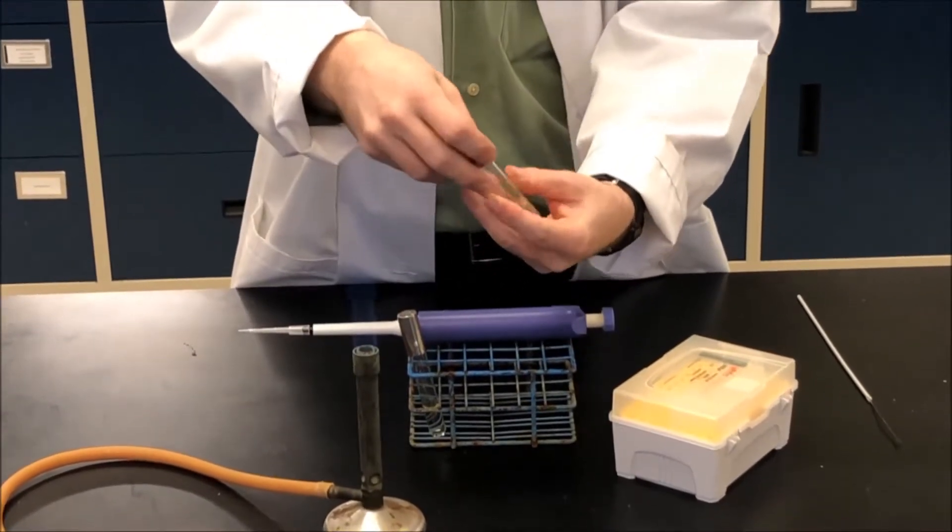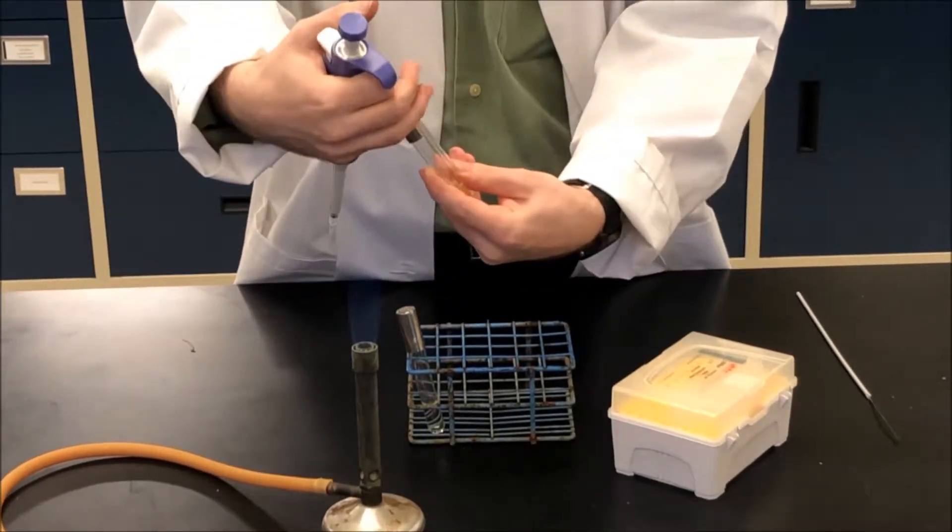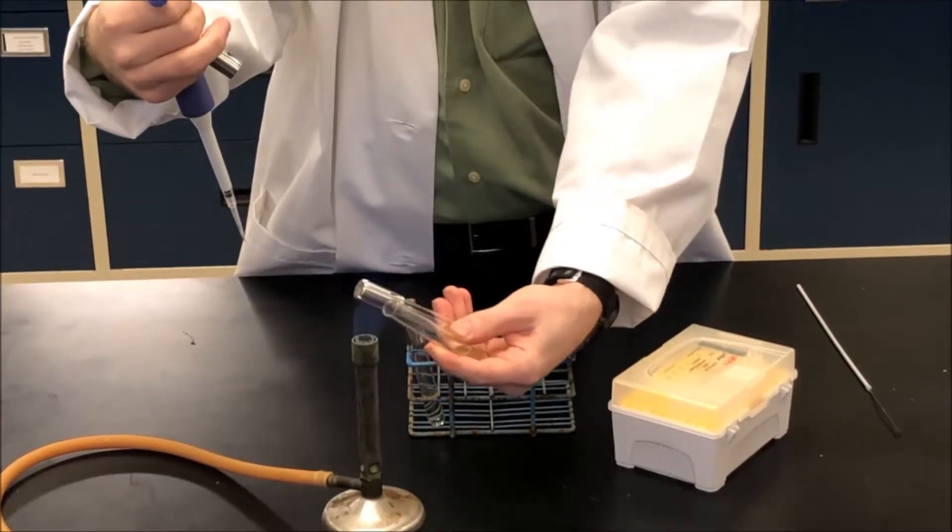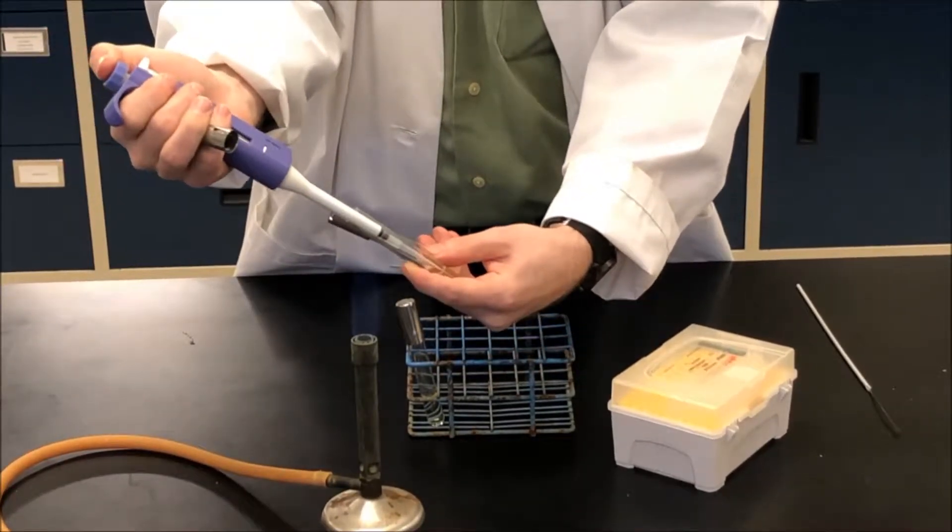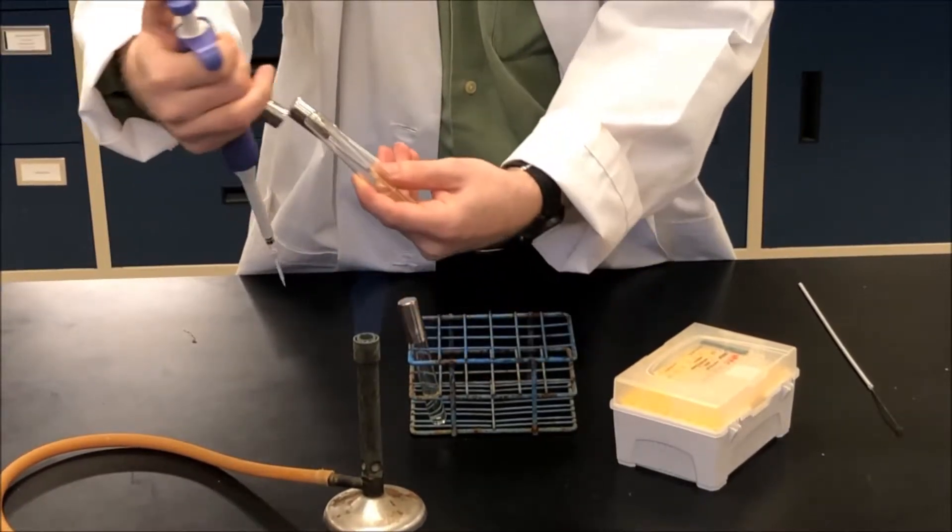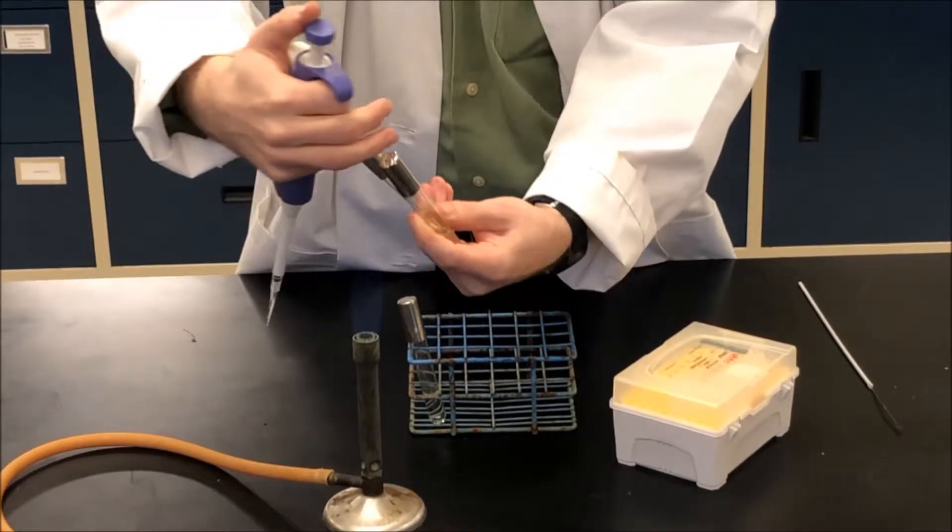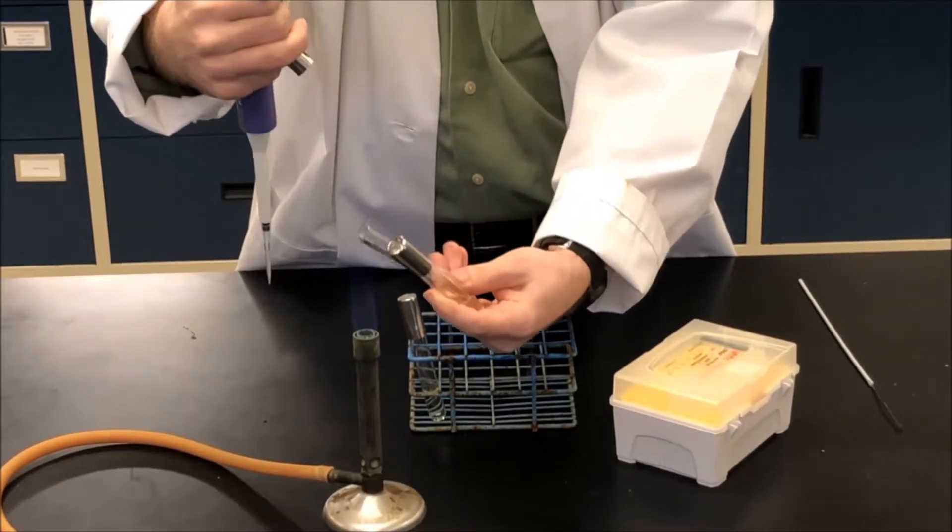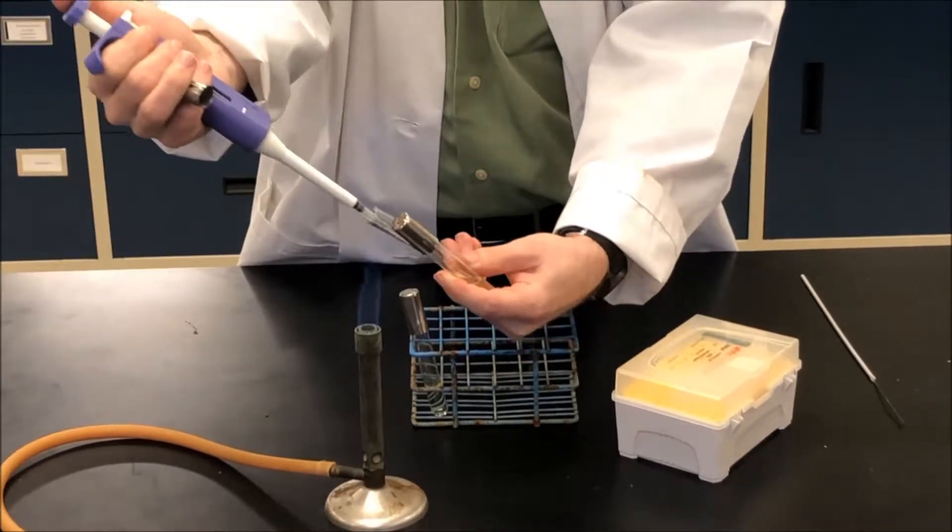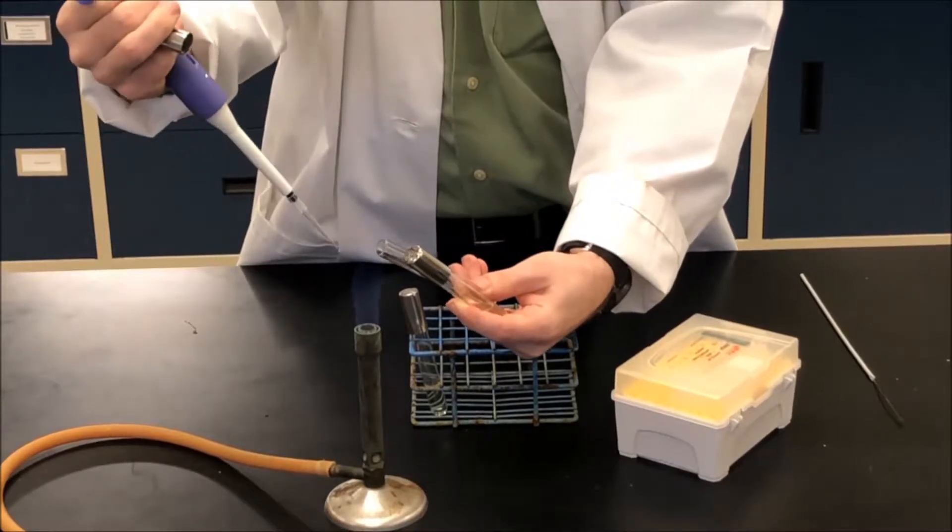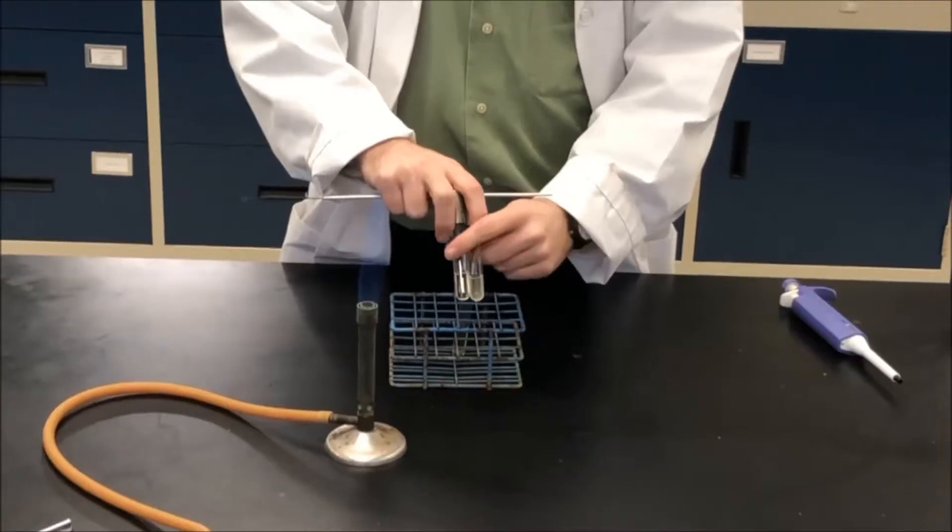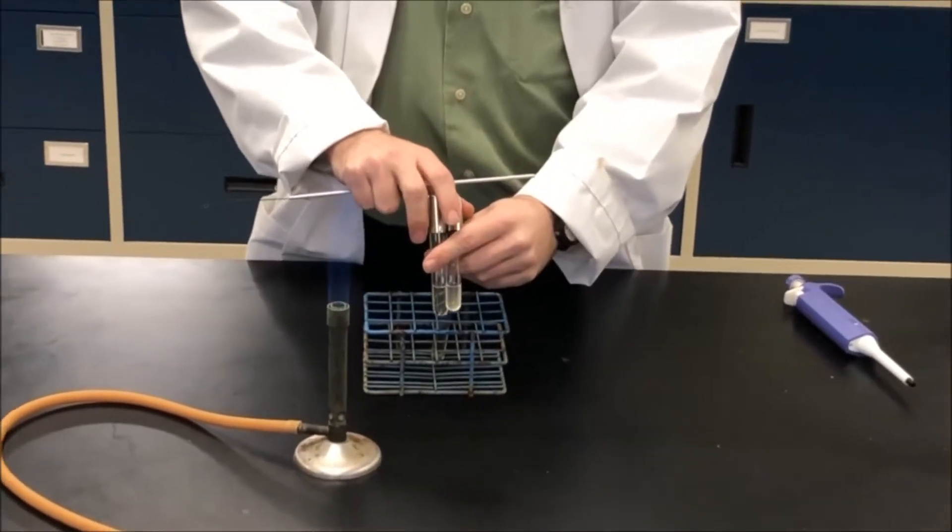I'm going to open the tube with the bacteria. I'm going to flame the lip and then take a sample, flame the lip, close my test tube, open up the test tube I want to inoculate into, flame the lip, and add my bacteria, flame the lip, and close the tube. So another way that we can inoculate growth cultures, besides using the micropipetter, is by using an inoculating loop.